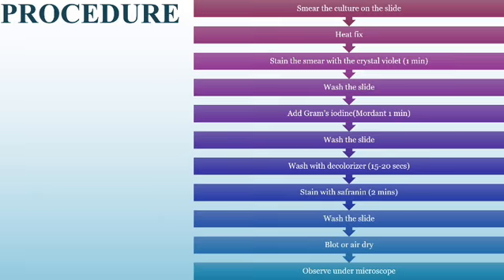But upon alcohol treatment, there is a lesser amount of lipid content in gram positive bacteria, and so the primary stain is retained till the end of the process and gram positive bacteria appear purple in color. But gram negative bacteria, being colorless after alcohol treatment, take up the counterstain or secondary stain we now add.